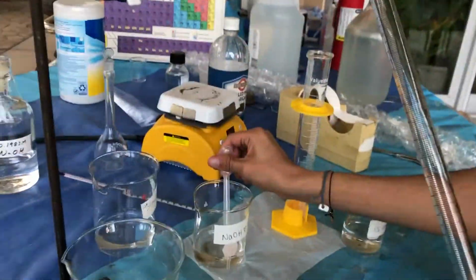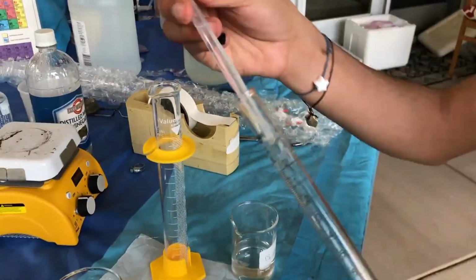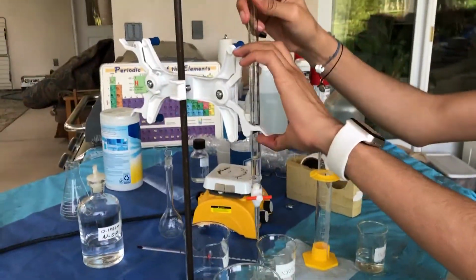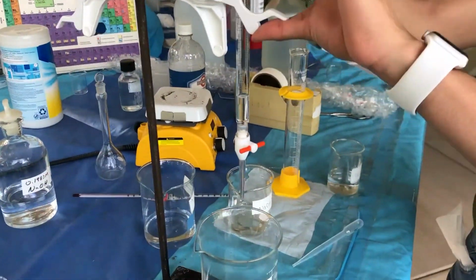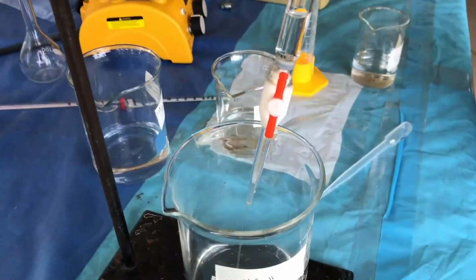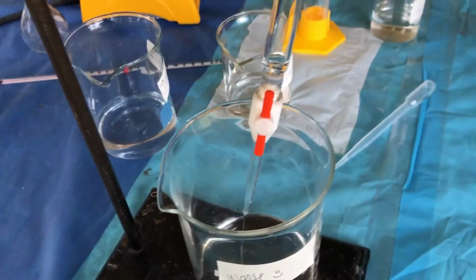Since we're vertically challenged, we take the burette out of the burette clamp and make sure the tip is closed. So we're going to rinse 3 times with sodium hydroxide into the burette, and we're going to swirl it around, make sure to get all of it, and then let it drain into the waste. You're going to do this 3 times. If it's stuck, you're going to flick it. Tap it a few times until it starts coming out, but don't break it.